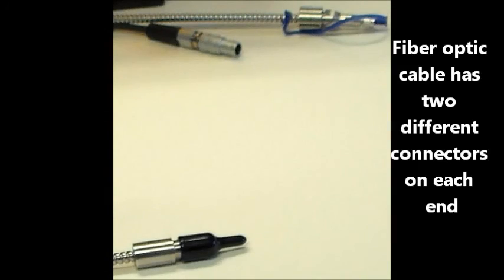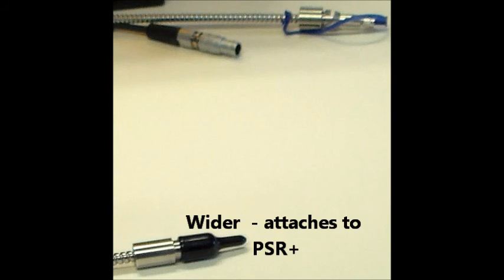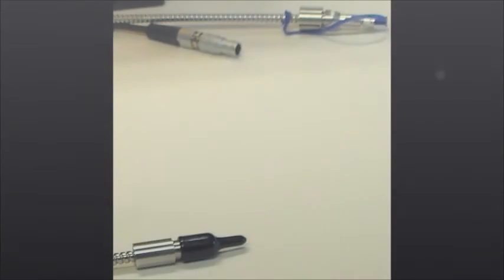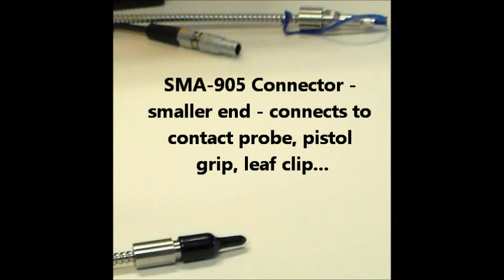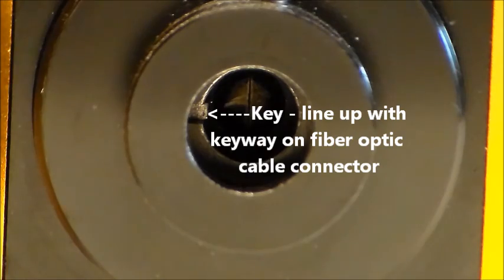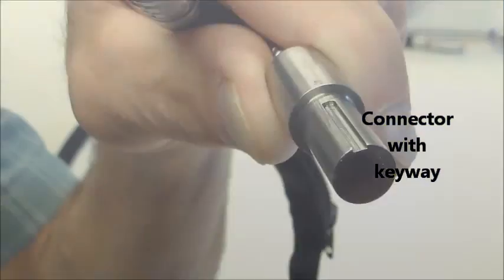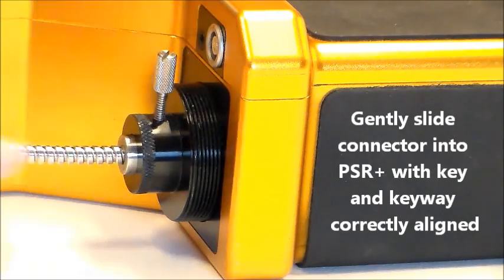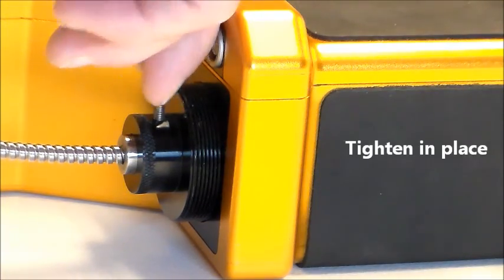The fiber optic cable has different connectors at each end. The wider end of the fiber optic cable attaches to the PSR Plus. The smaller end of the cable with the SMA905 connection attaches to the contact probe, pistol grip, or leaf clip. In this close-up you can see the key. Gently insert the connector with the keyway into the adapter so the key and keyway line up. You can see how far in the cable sets. Tighten the set screw for a solid connection.